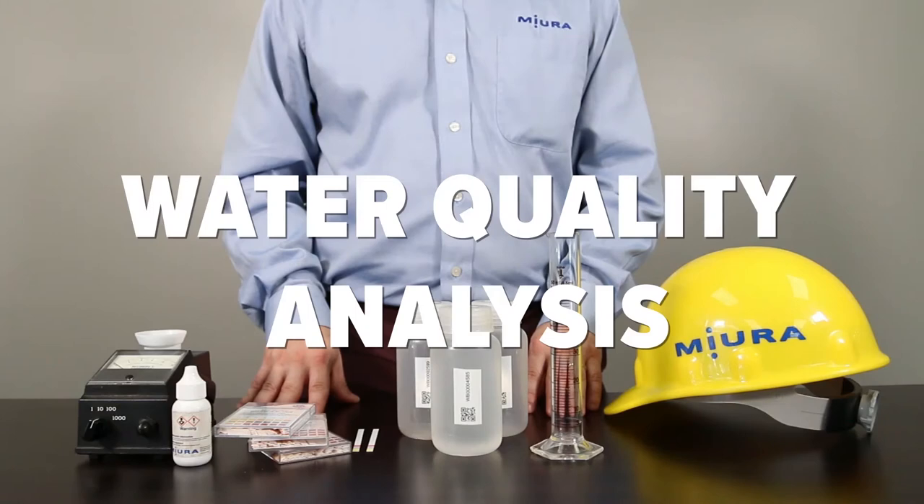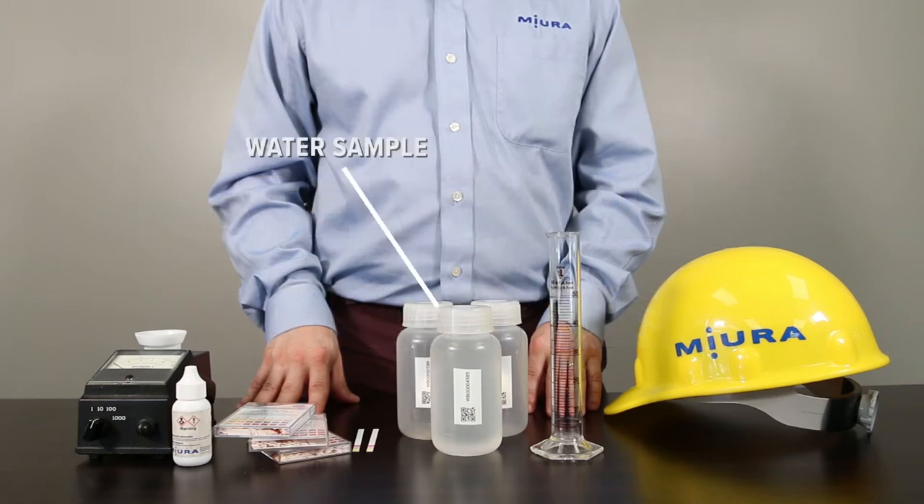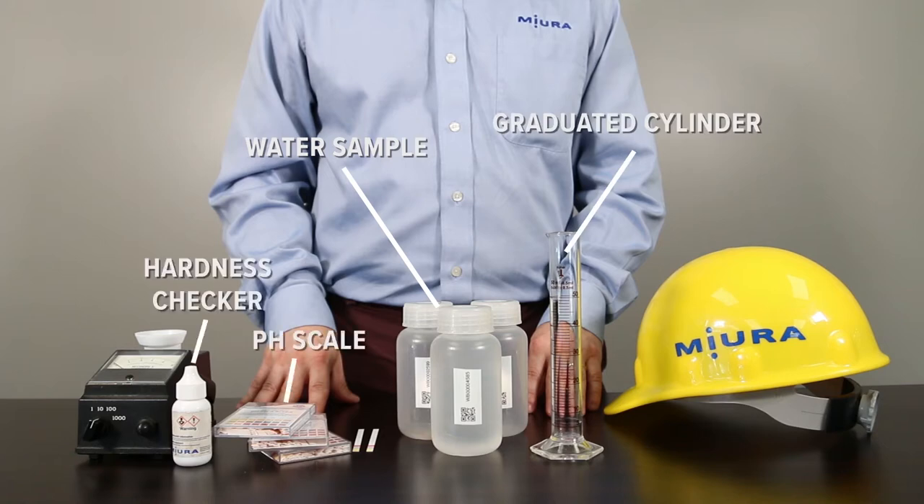Now that your sample is collected, it's time to analyze the quality. The basic tools for a field water analysis are as follows: water sample, graduated cylinder, pH scale, hardness checker, and conductivity meter — analog or digital.